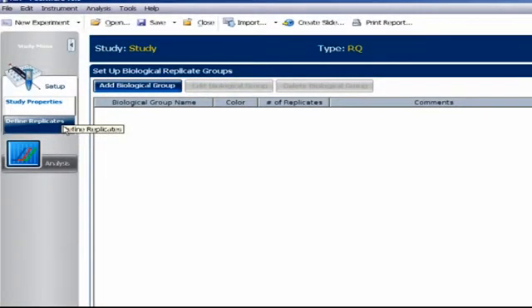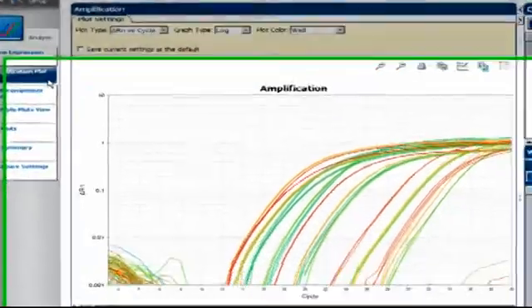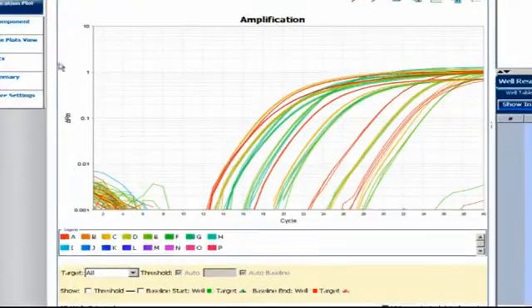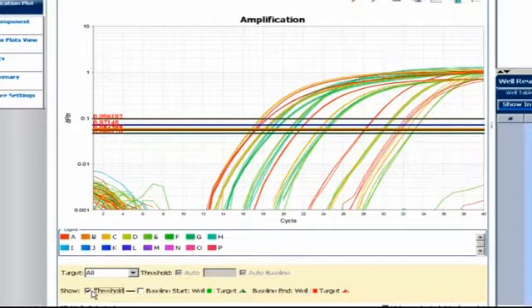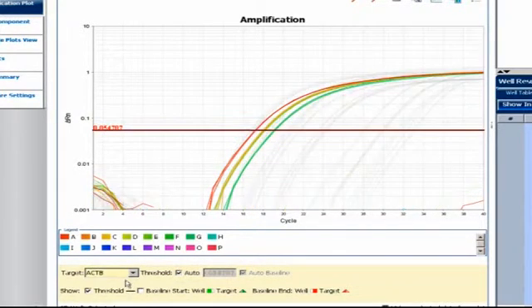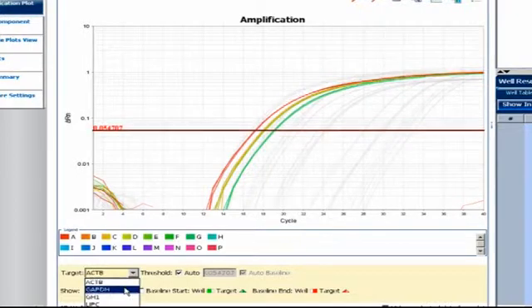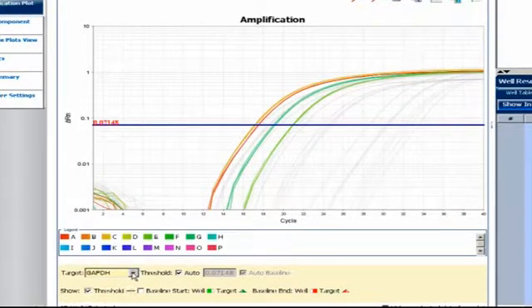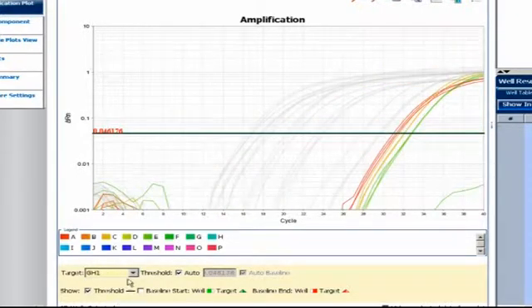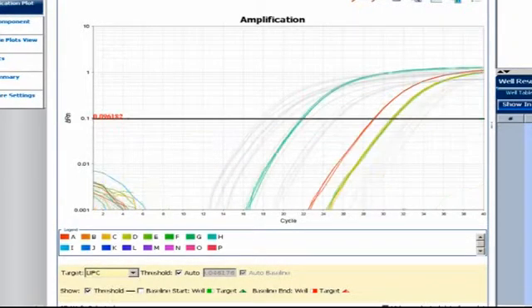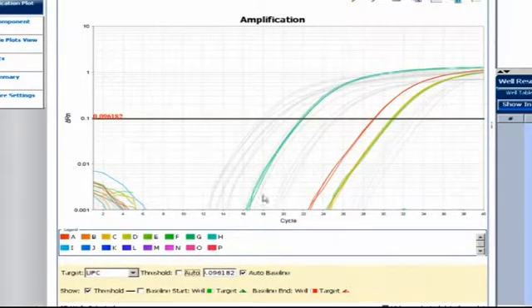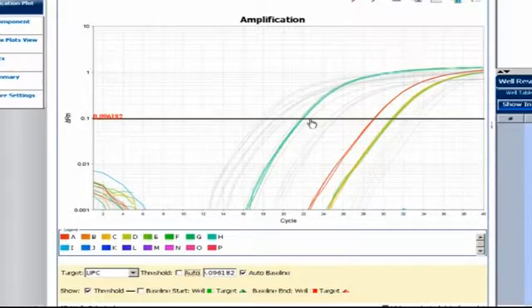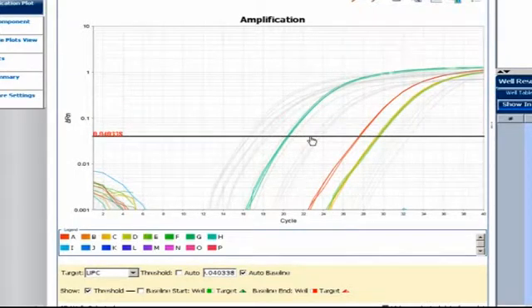Let's get back to our original study. Finally, go to Analysis under the Study menu, confirm that the thresholds are set correctly by using the Target pull-down menu to toggle through each. Adjust any thresholds that you feel are set too low or too high by selecting that assay, unchecking the Auto button, and moving the threshold with your mouse.